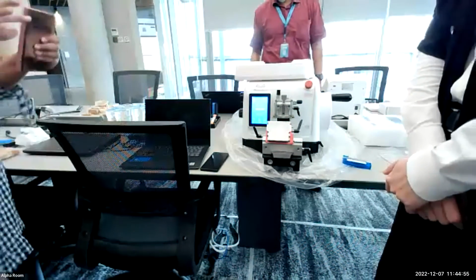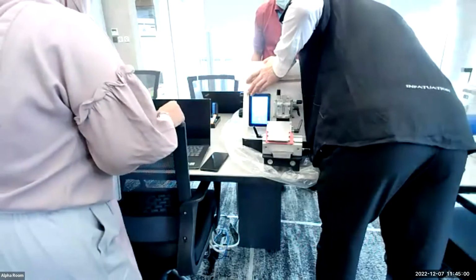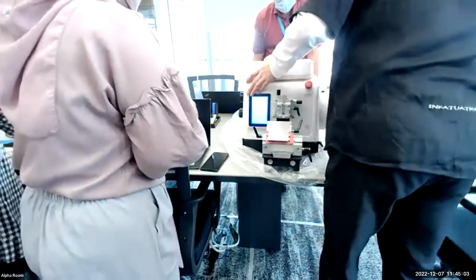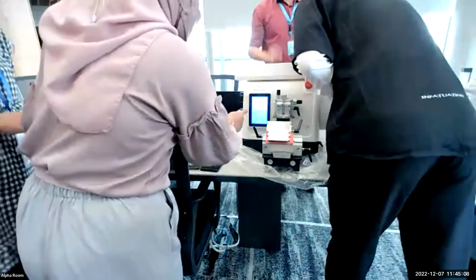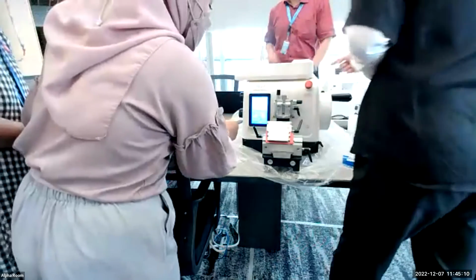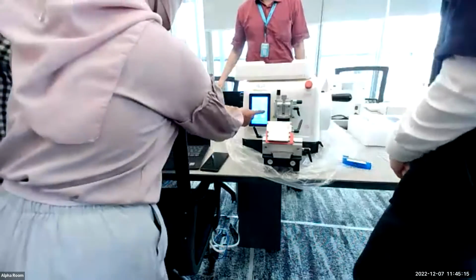For the auto functions, to get the log data, use USB to export it. It will include the operation log and the error log. Can the names of the preset cutting sizes be changed? Oh, the preset. We know this: rename at the computer. You can use the USB to export. So it cannot be renamed on this machine.